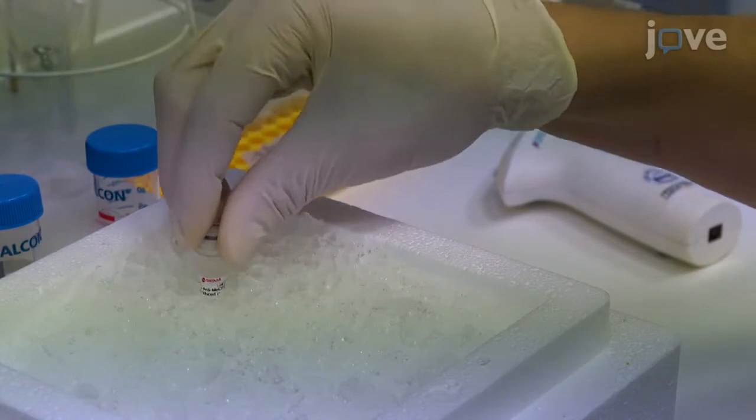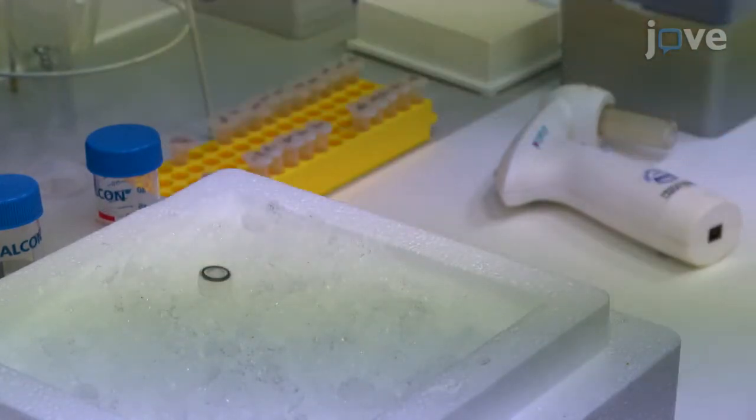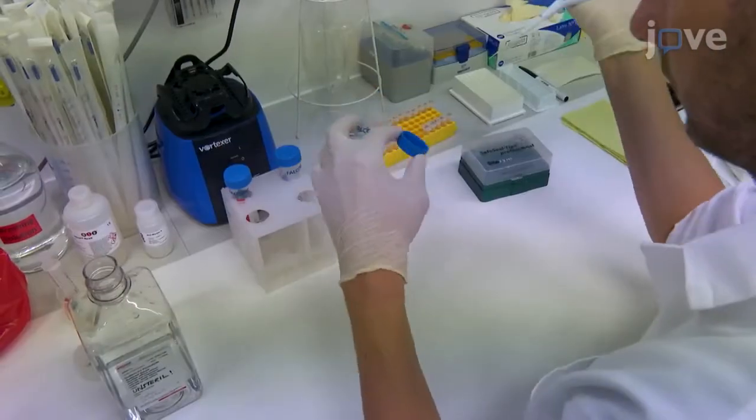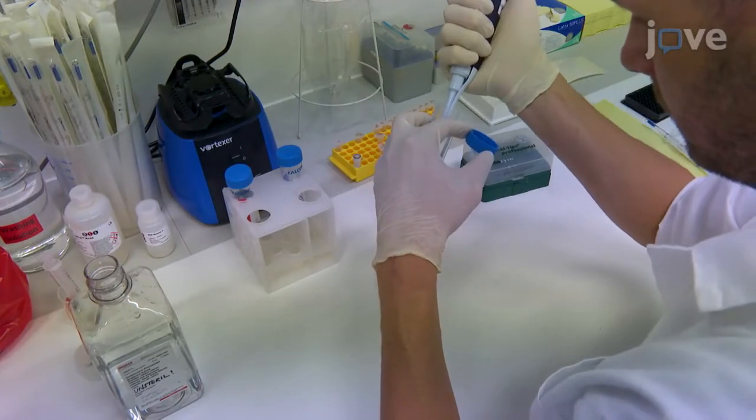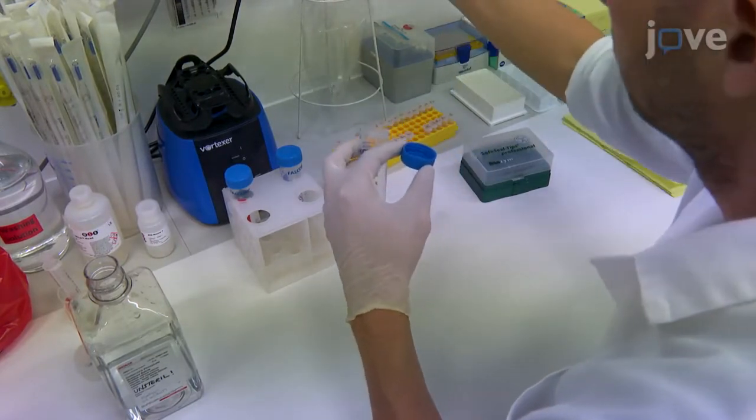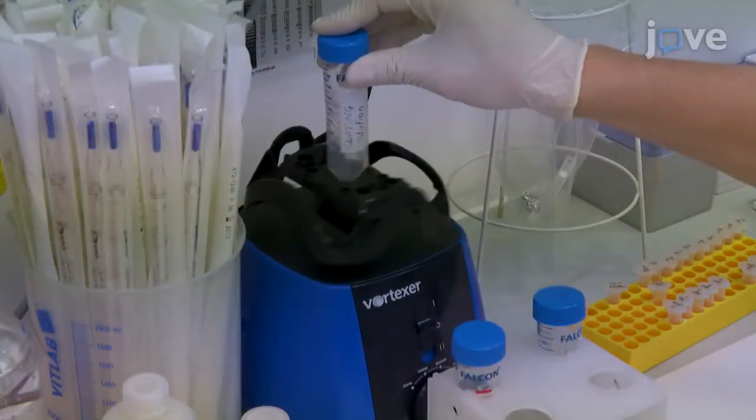Next, thaw the monoclonal mouse anti-MeCP2 antibody on ice. Mix 0.67 microliters of the antibody with 4 ml of PBS, then vortex the solution.